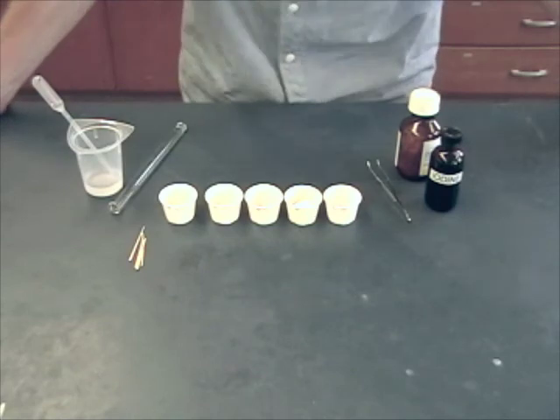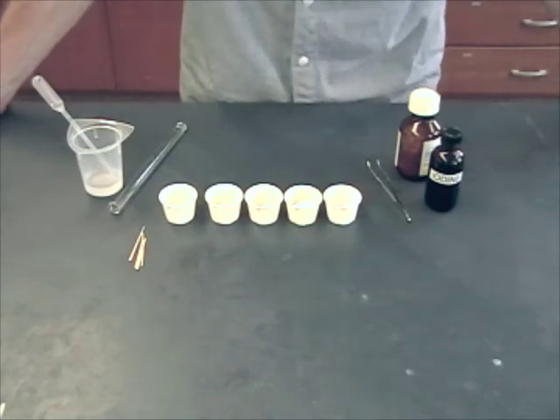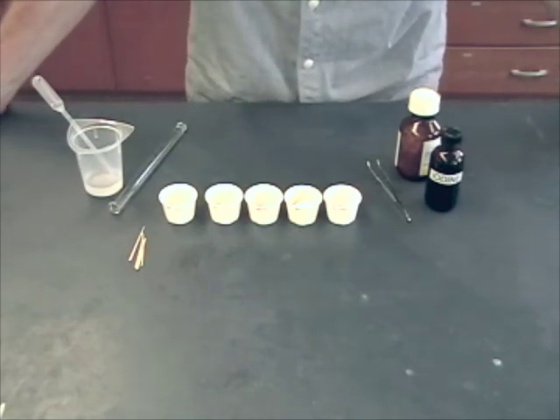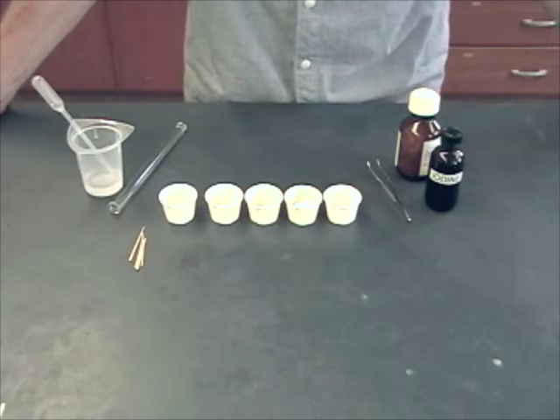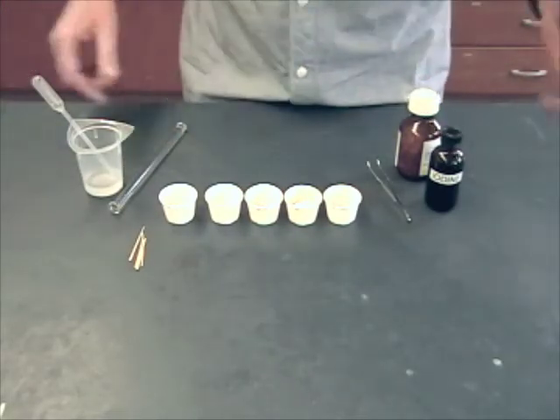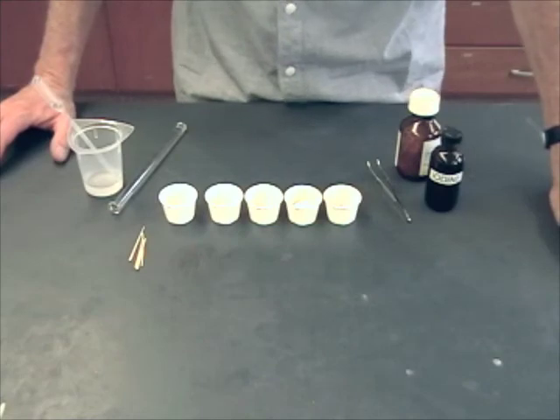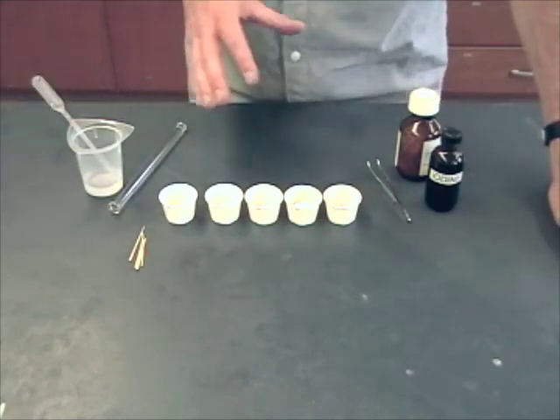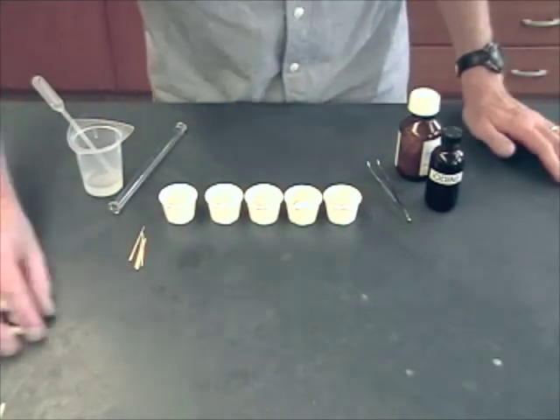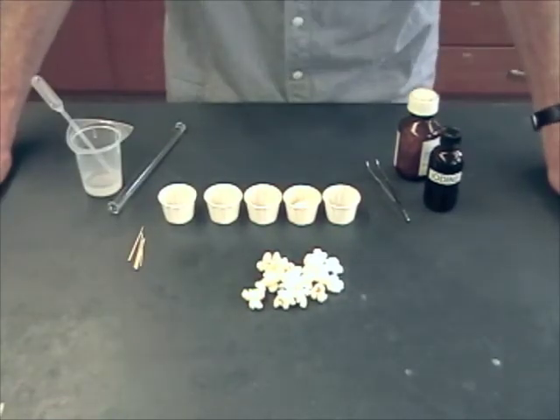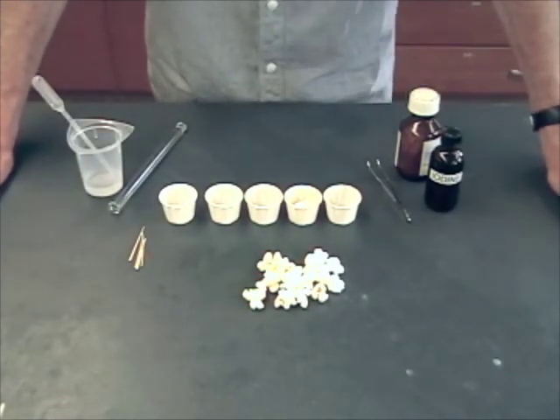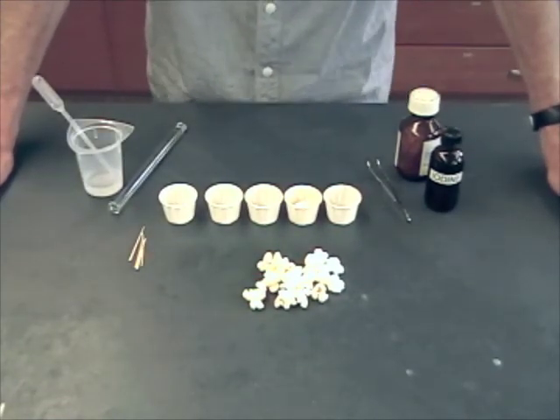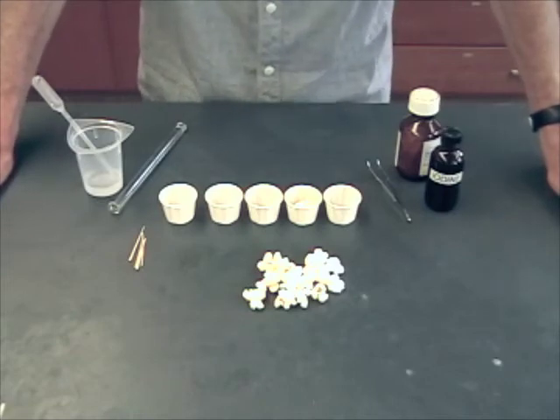So your group has developed a hypothesis about whether or not there's an enzyme in saliva that will break down starch into simple sugars. And now what you have to do is come up with an experiment using pretty simple materials to test that hypothesis. So you're going to have these little cups. You're going to have some reagents we'll talk about. And, of course, you'll have fresh popcorn. Now, one thing you're going to want to do is chew up the popcorn, mixing it with saliva, and then spit it out into one of these cups.